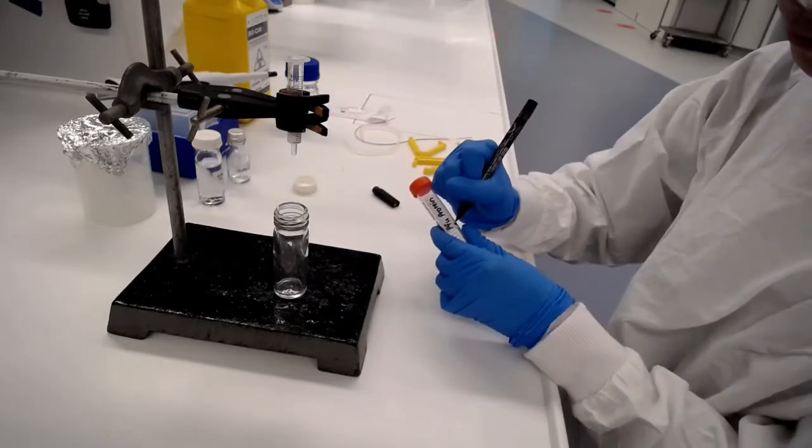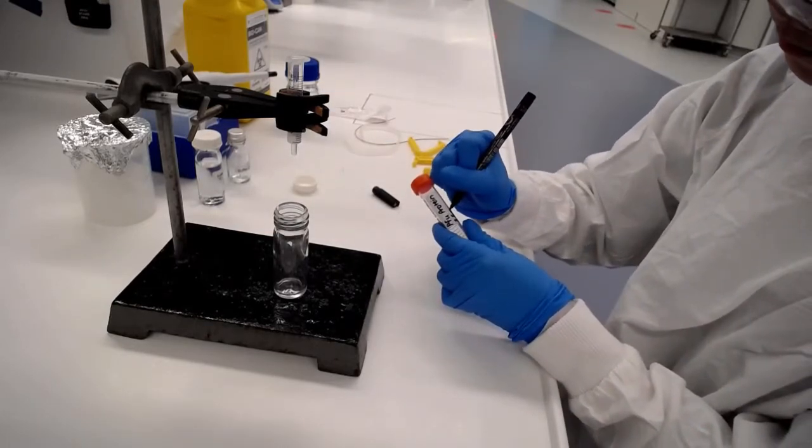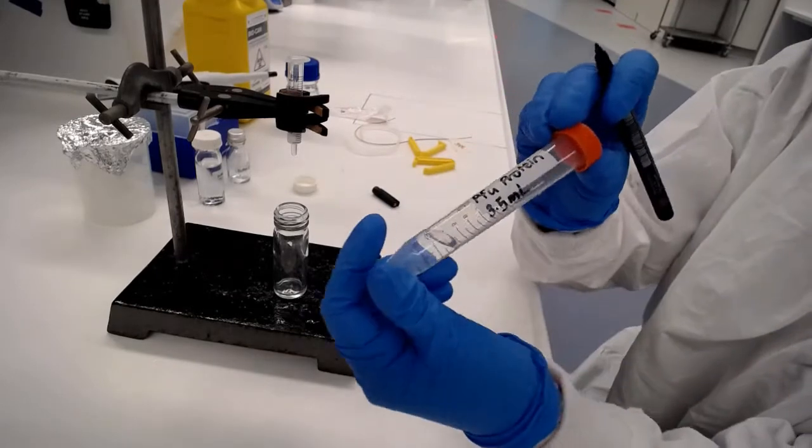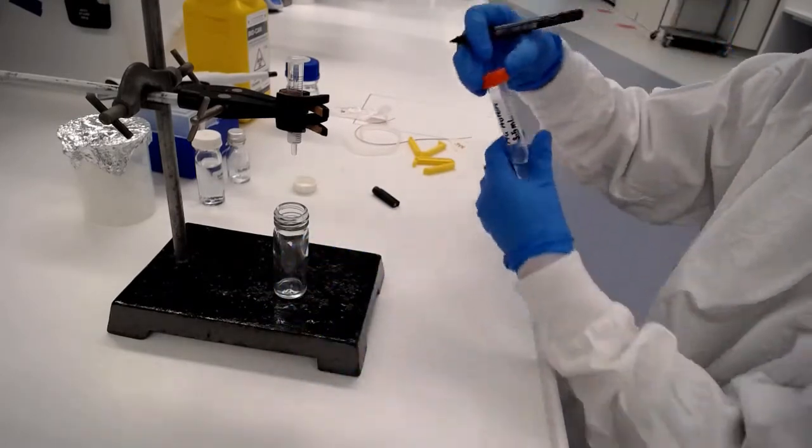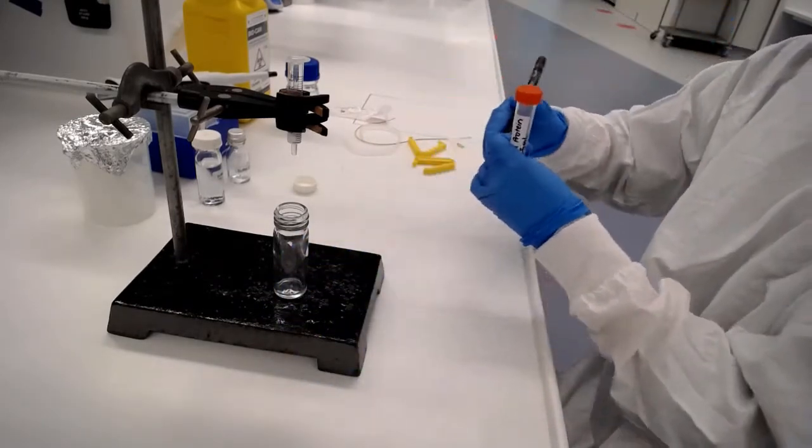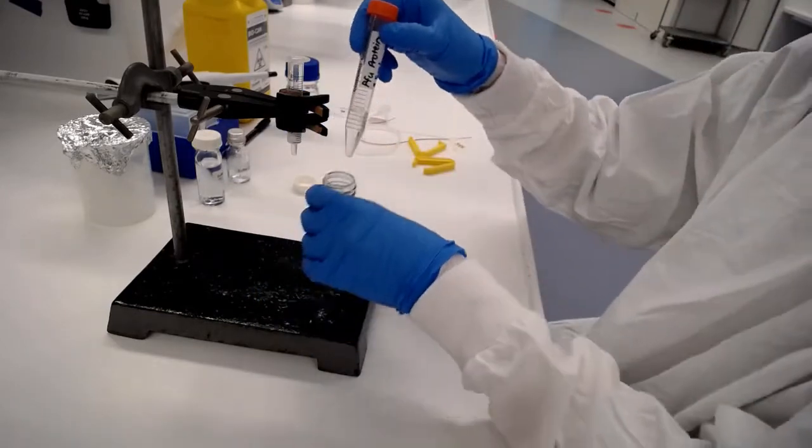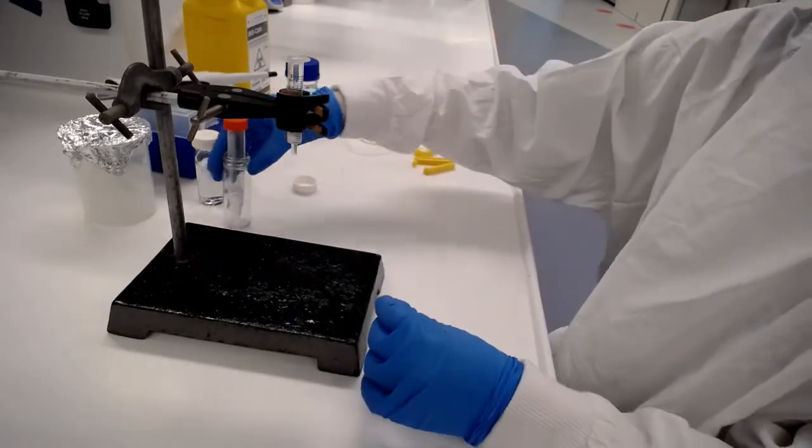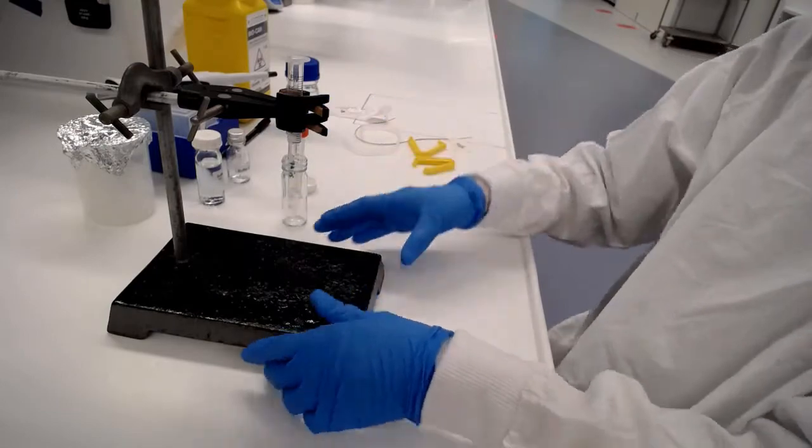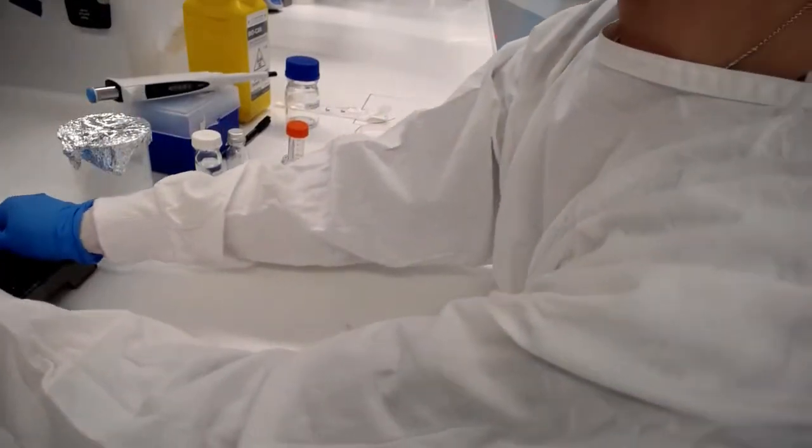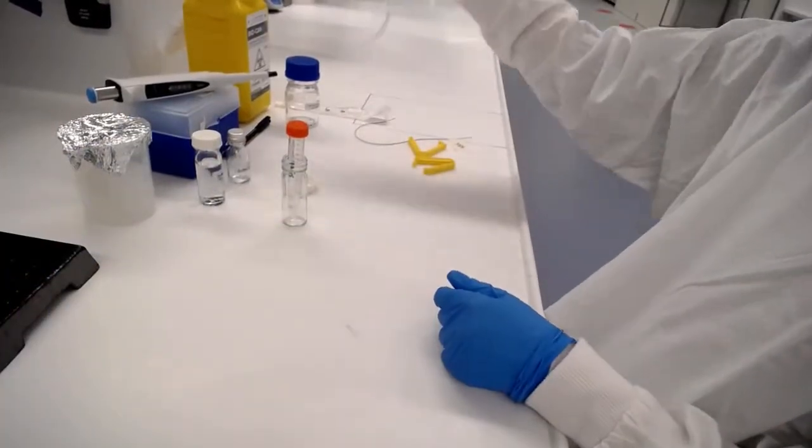It should be close to three mils since that's what we added to the top of the column. Going to write that on the tube here, we're also going to add that to our lab archives notes. The next stage is to transfer this partly purified protein into our dialysis tubing.